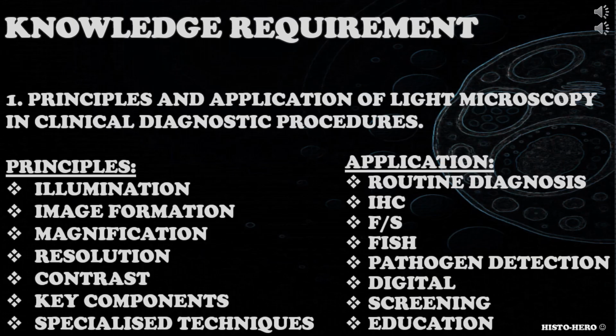Consider illumination, magnification, image formation, working parts of the microscope like light source, condenser, diaphragm, objective, eyepiece, or stage, specialized techniques like bright field, dark field, phase contrast, differential interference contrast, fluorescence, confocal, or polarized. Also consider applications for routine diagnosis, IHC, FISH, screening, intraoperative assessment of F/S, digital pathology, education.